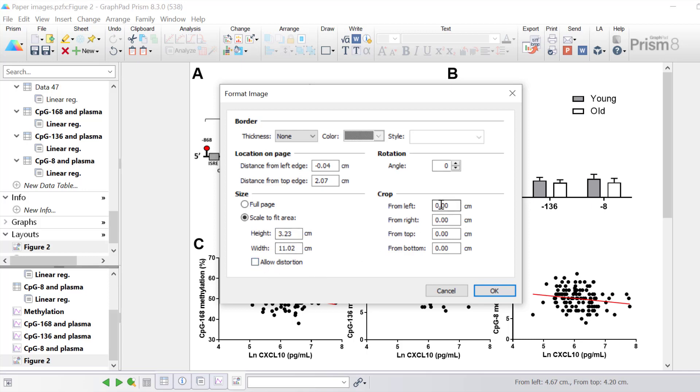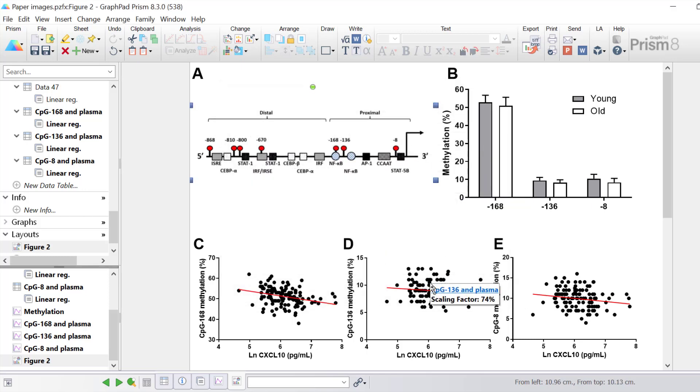If you wanted to crop part of the image you can specify in these text boxes here how much you want to crop from the left, right, top and bottom of the image. For now just click cancel to return back to the layout page.